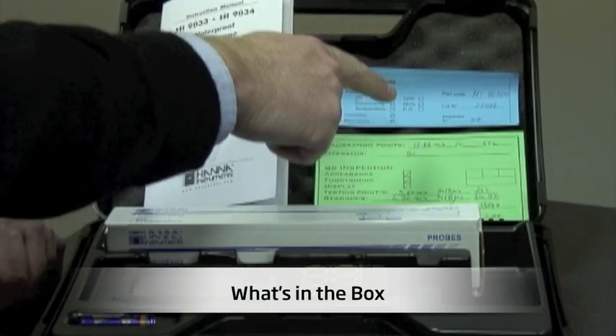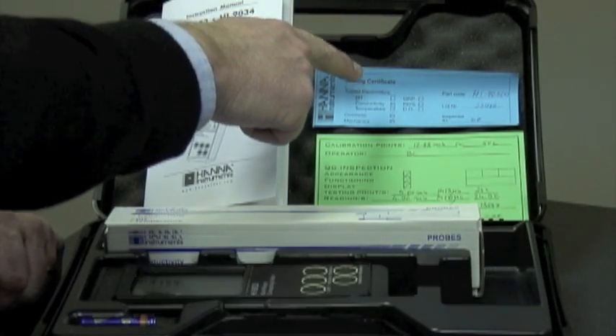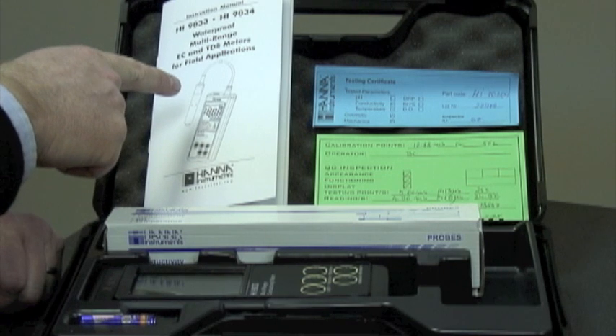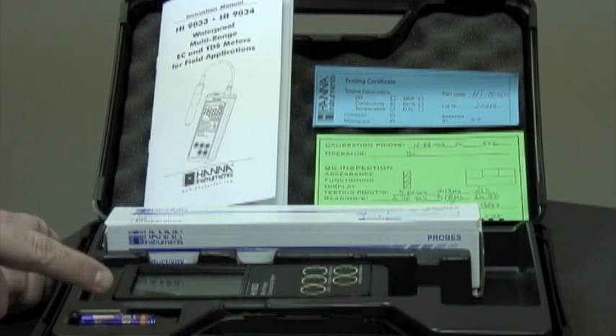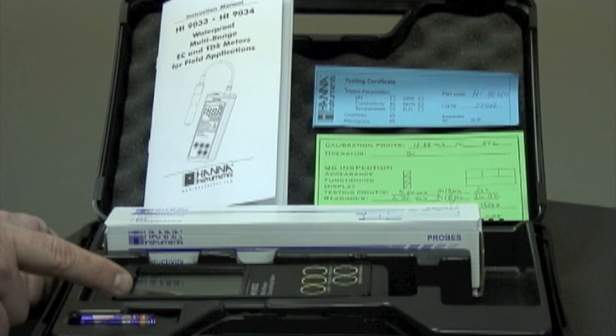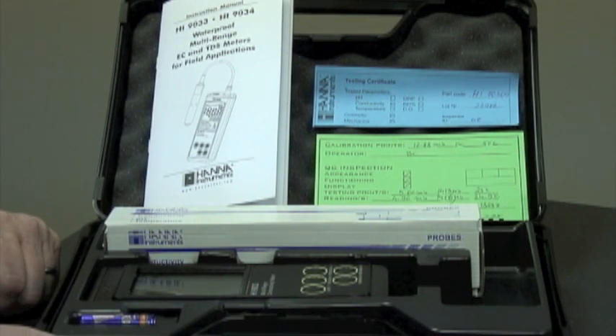Here we have the calibration certificate, testing certificate for the probe, the instruction manual, the electrode itself, the meter, and batteries — all contained in a rugged plastic carrying case.